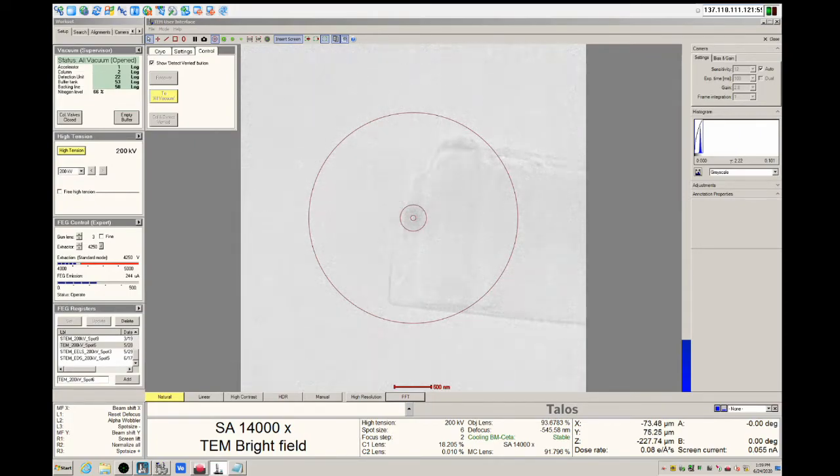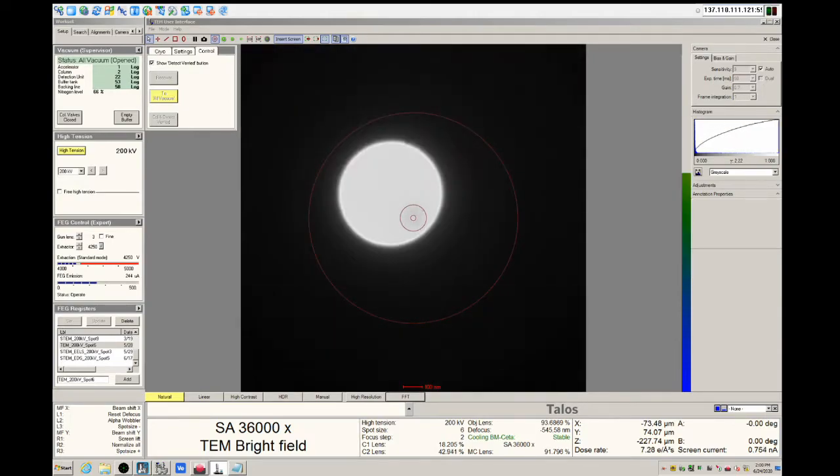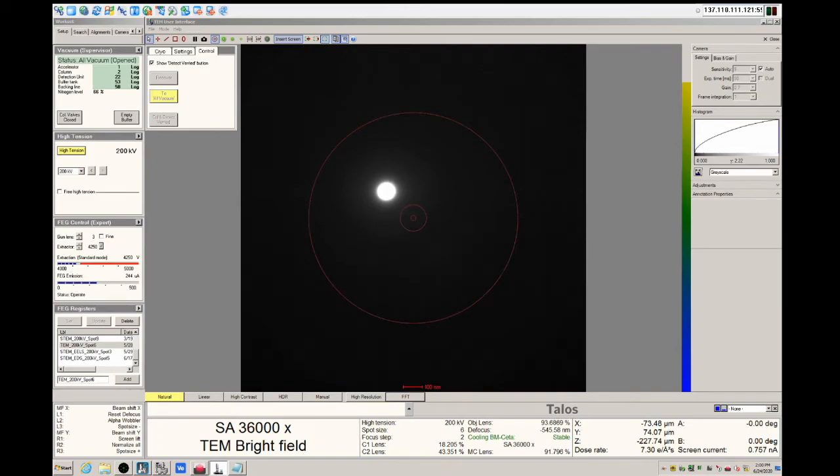Ideally, the next alignments are performed in vacuum. You may not be able to find a vacuum region easily on your sample, but in the case of a lamella, we can just move away from the lamella portion of the sample because empty space surrounds it. The first alignment requires a spot. Reduce the intensity using the intensity dial on the hand panel to form a spot.